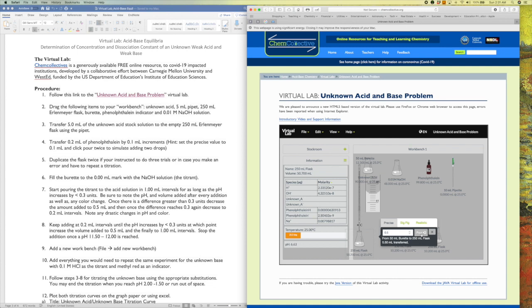So that went up by 0.13. So that's still okay. I can probably do another 0.5, but remember, we don't want it to increase by too much more than 0.2. So that was about 0.2, right? So I'm going to take this down again now. I'm going to take this to 0.2. And let's see. I'm going to pour it. Right, so that was 0.1.